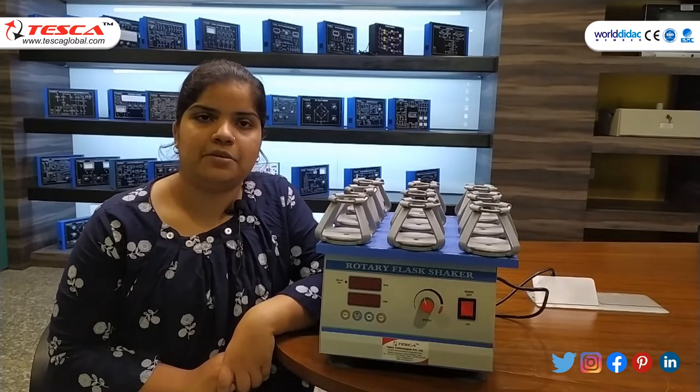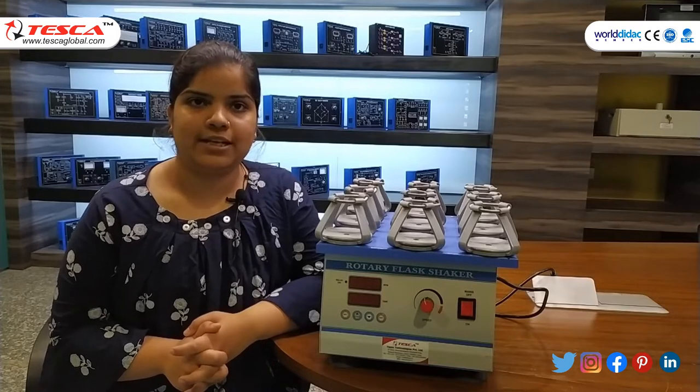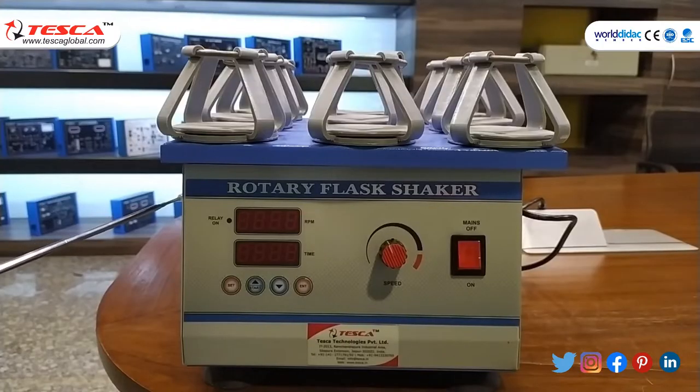These shakers are mainly used for development and mixing of chemical, culture, and pathological work. It works on a brushless DC motor with variable speed function. This unit has a base assembly fabricated with heavy mild steel section.